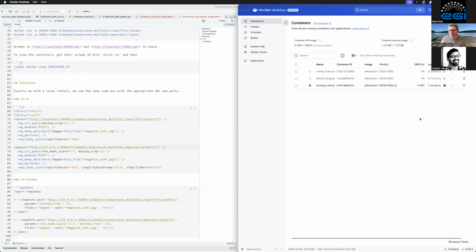Okay, so overall, three solutions to run it. Either you run it online on the Welton cluster and you don't have anything to install, which is the easiest. The second easiest is probably the Docker version. Although it doesn't work right now, I'm sorry, normally in Docker Desktop it's just clicking a few things and waiting for the download to happen.